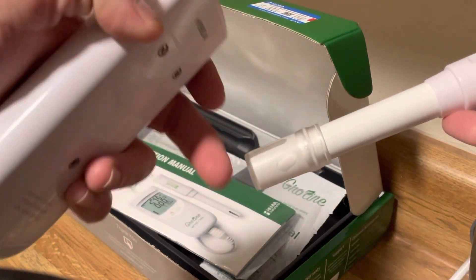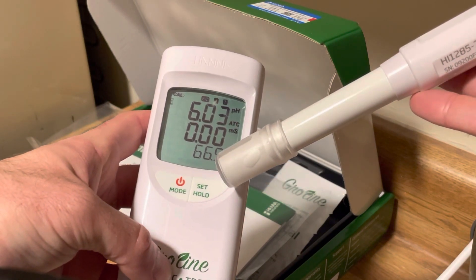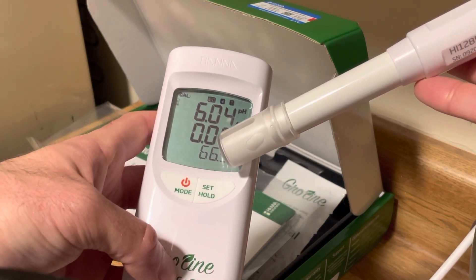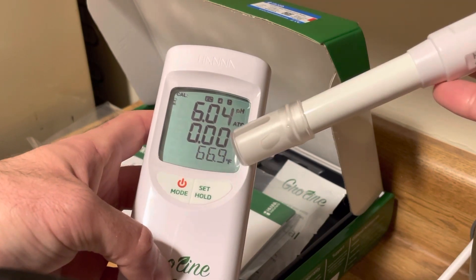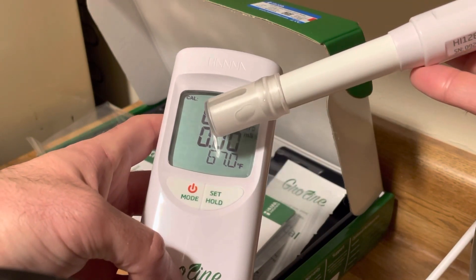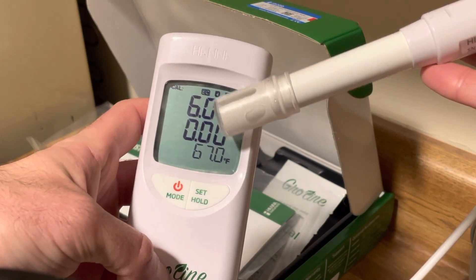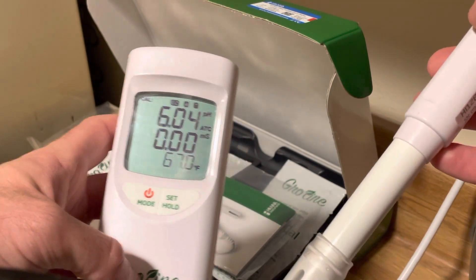When we're ready to use this, we're going to take the cap off, rinse it with some clean water, and get it ready. On the display you can see it tells you the temperature in Fahrenheit, the 0.00 is your electrical conductivity — how much nutrients are in the solution — and then the pH. It's reading at a 6. At the top it says 'EC 4 and 7,' which generally means it's calibrated and ready to go.